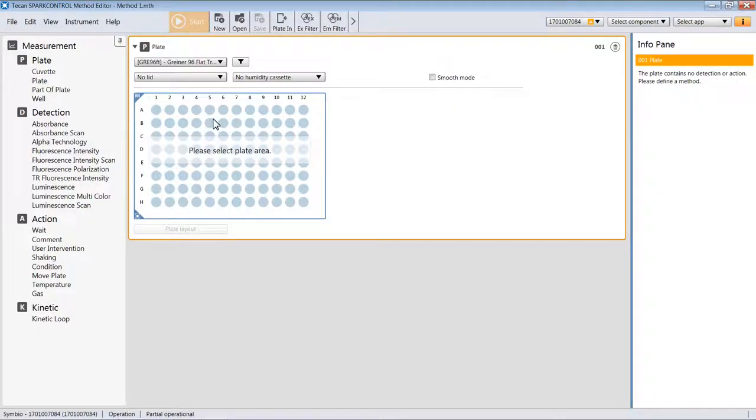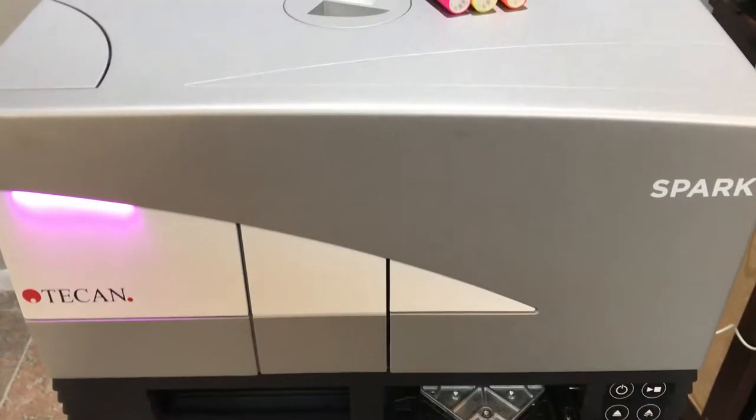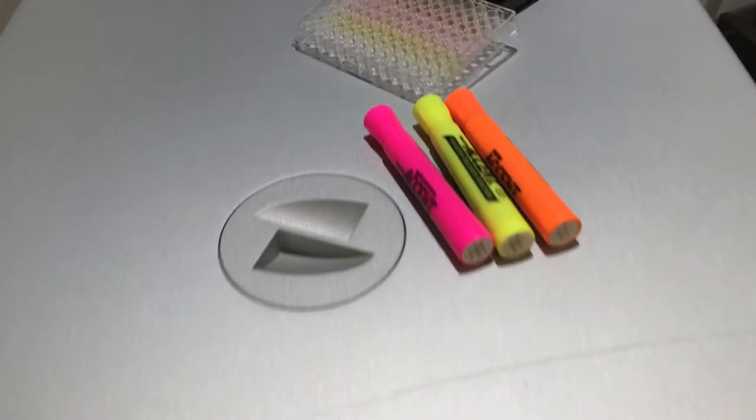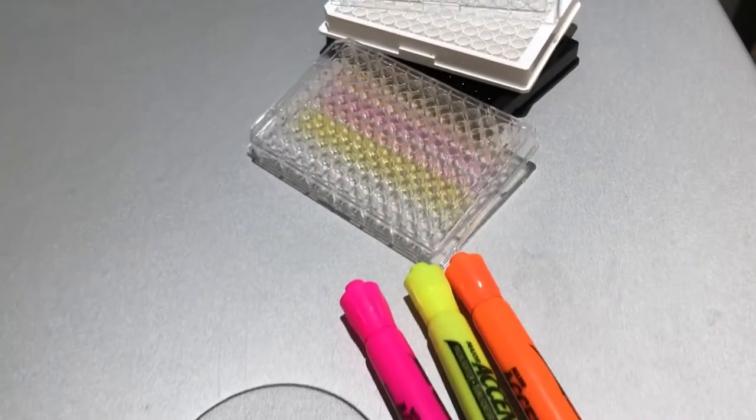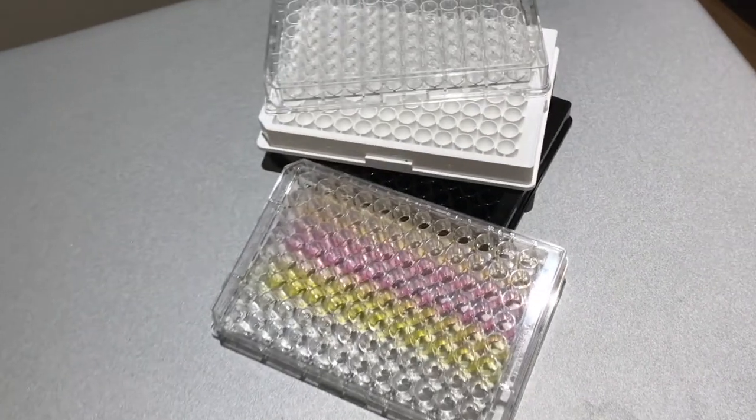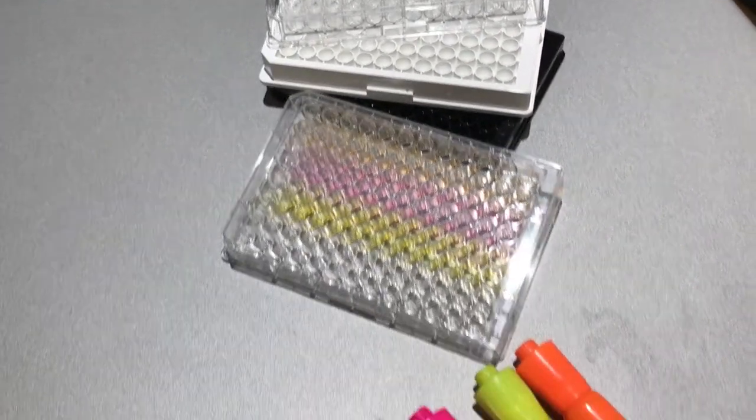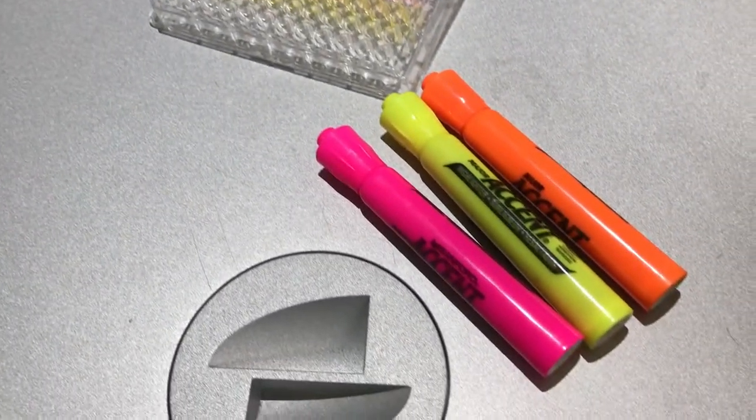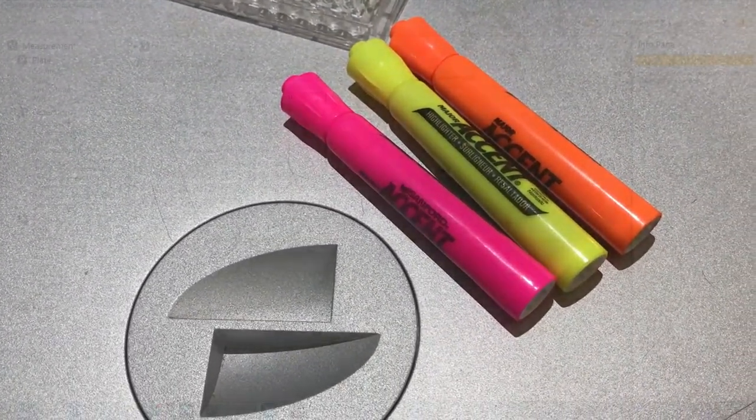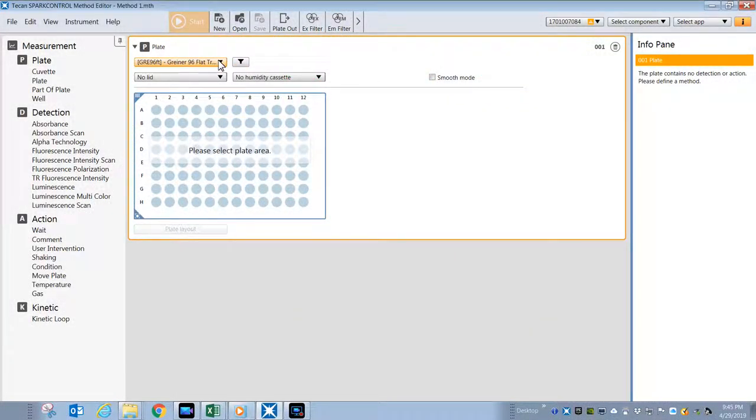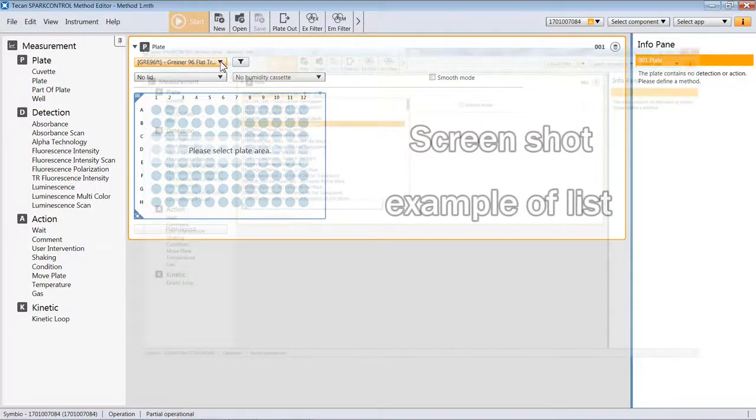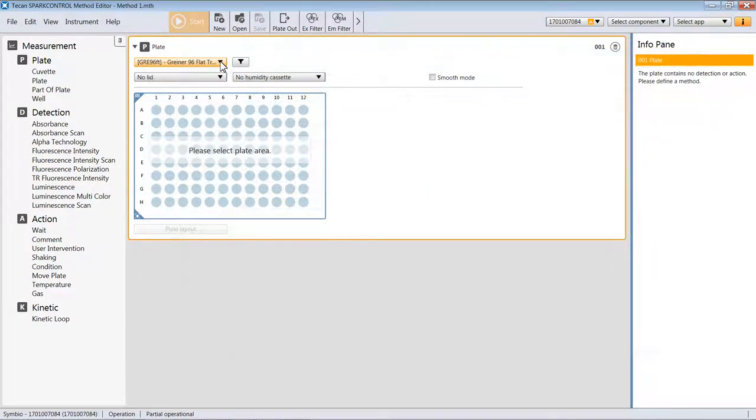The first step in the creation of any method is to select a plate definition to match the plate you're using. I want to first explain that I'm using these fluorescent highlighter pens on this clear microplate where the pens have been drawn across the bottom to create some signal. If you're ever in a pinch for a fluorescent standard or something to test the functioning of your instrument, then pens like these are very useful. In this example, we're going to select a clear, flat, transparent microplate. You can scroll up and down and select from a variety of different plates. If you don't find the plate that you're looking for, you would contact TCAN and they could help provide you with the correct definition.